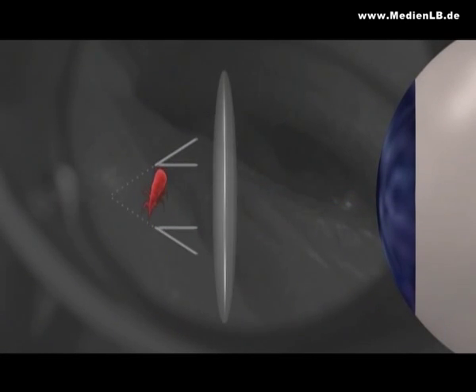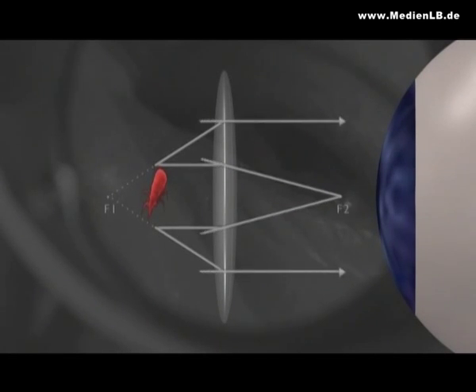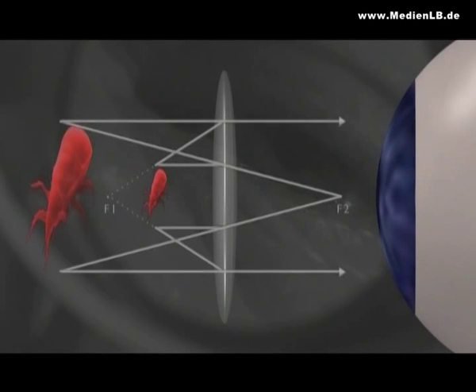The magnifying glass, a convex lens, positioned between the eye and the object, refracts the light rays from the specimen in such a way that a magnified, upright, virtual image is created for the eye. The specimen is projected outside and the visual angle thus enlarged.